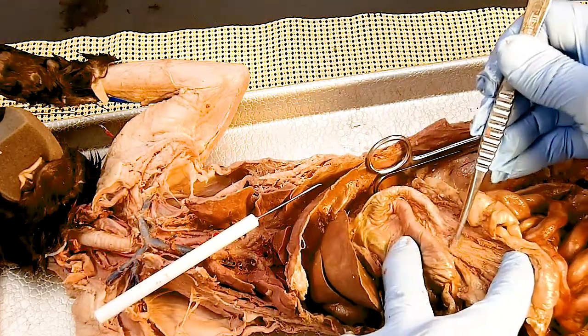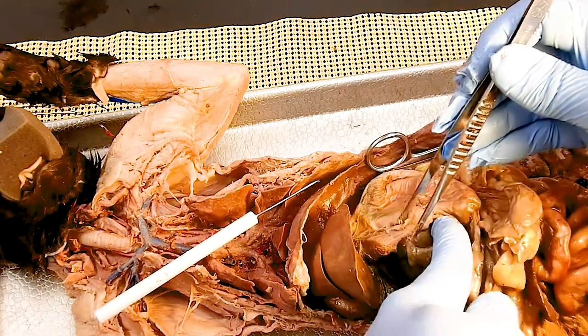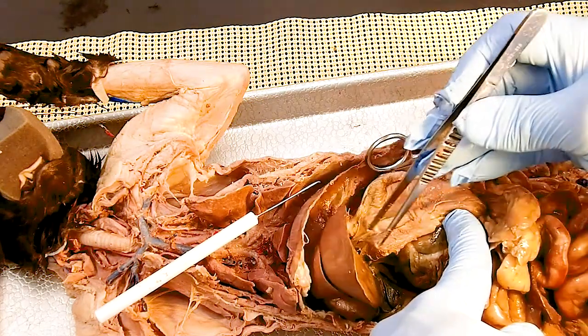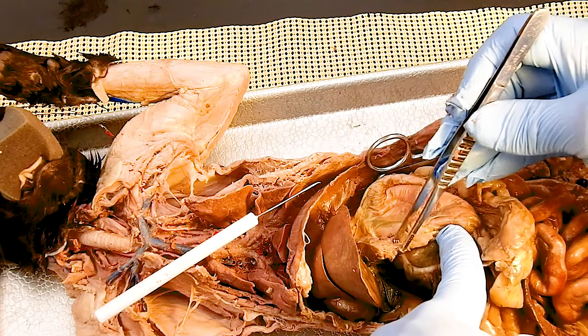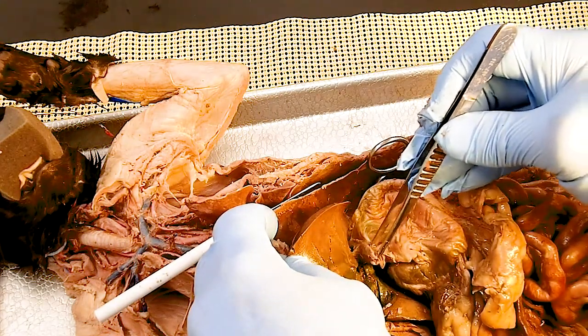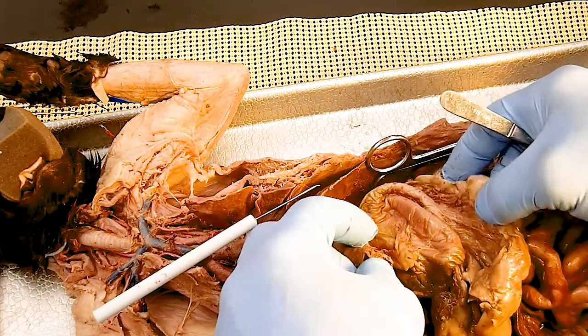Greater curvature is right here, lesser curvature is up here. And you'll see a delicate membrane right here connected from the lesser curvature to the liver right here. This whole delicate membrane, that's the lesser omentum, which you can't see on our human models. There's a little lobe of the liver almost poking through it there. But that delicate thing is the lesser omentum.